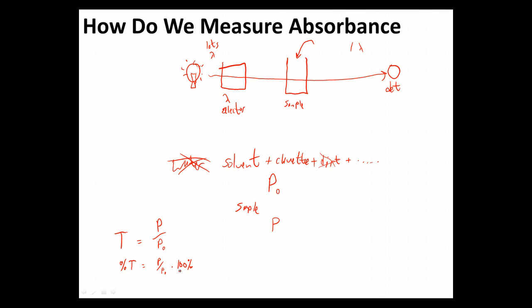Great, so we're talking about transmittance. But in the other videos, weren't we talking about absorbance? We need to get from how much light got transmitted through my sample into that nice absorbance unit that's actually going to have a linear relationship with my concentration, right? Now, for that to happen, what we need to do is take the negative log of transmittance. So negative log of transmittance, notice not percent T, that will equal absorbance. This is one of our important relationships to remember.